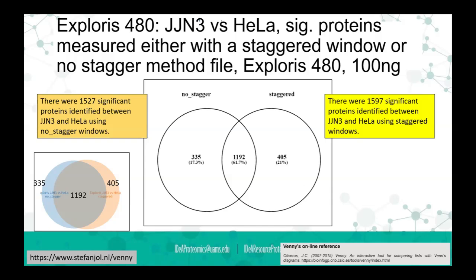But I'm glad you're looking into this, because the whole reason for having a staggered workflow is that the instruments at the time weren't fast enough to be able to do two Thomson isolation windows at whatever speed the newest instrument has. Sorry for interrupting. No, that's good. The nuances between staggered or overlapped, we can get into that some other time.